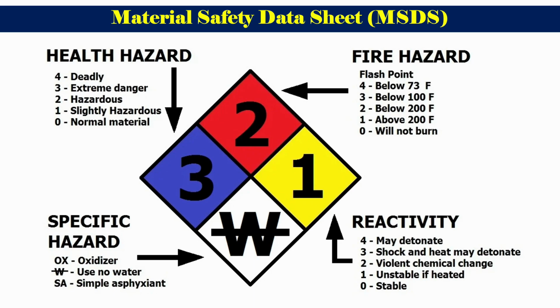Followed by 2, which is marked with red color, that is included for fire hazards. So there are different flash points from 0 to 4 for fire hazards material.